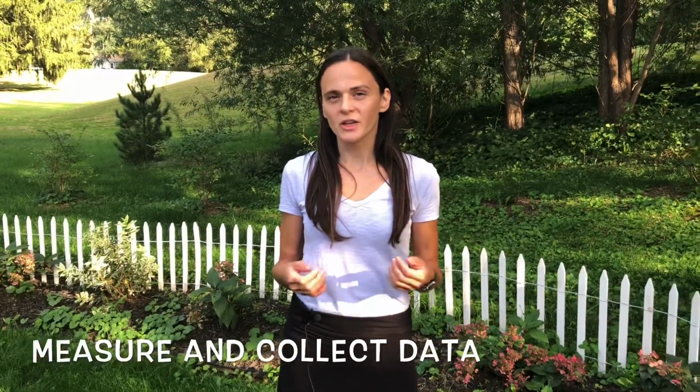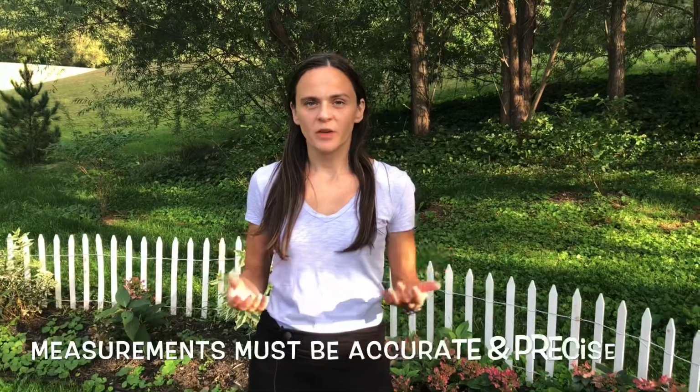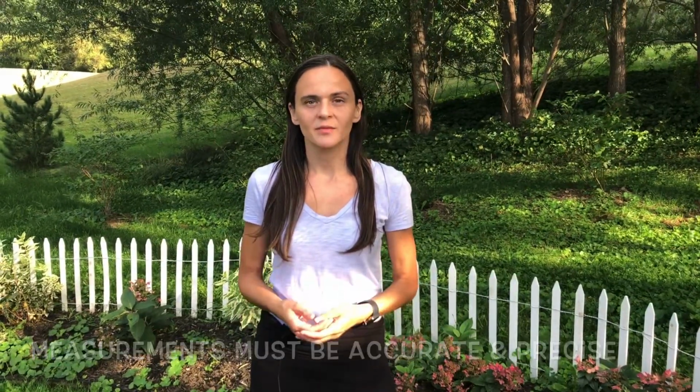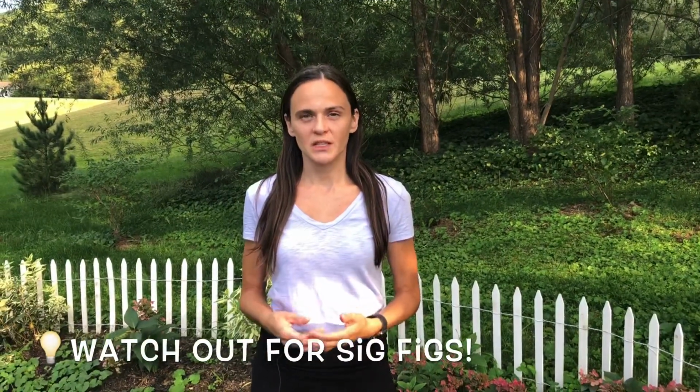This week's experiment is measurement and data presentation. The purpose of the lab is to use various measuring devices to gather data and present data using a computer program. When using various measuring devices, you want to be as accurate and precise with your readings. Each measuring device will give you a certain number of significant figures.